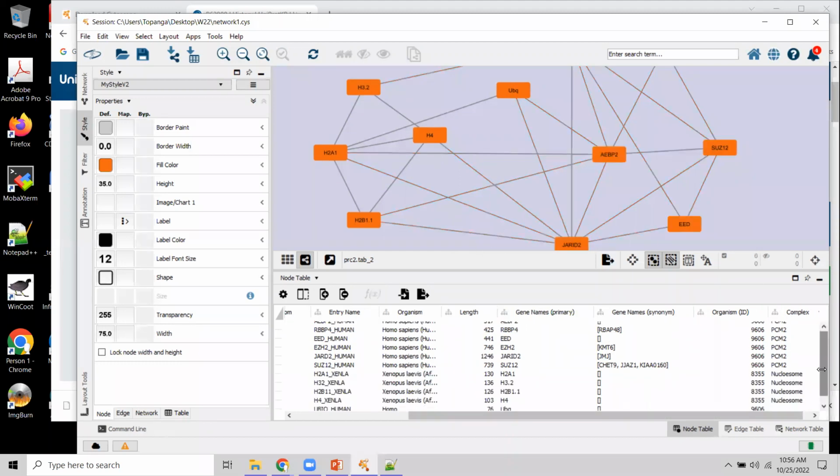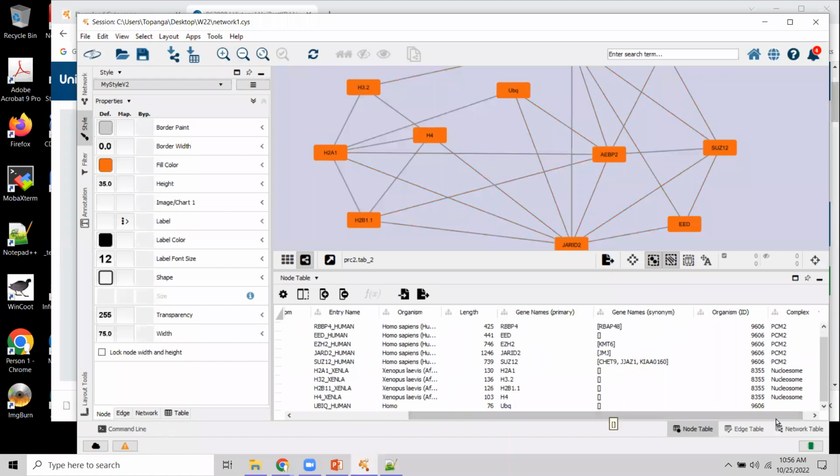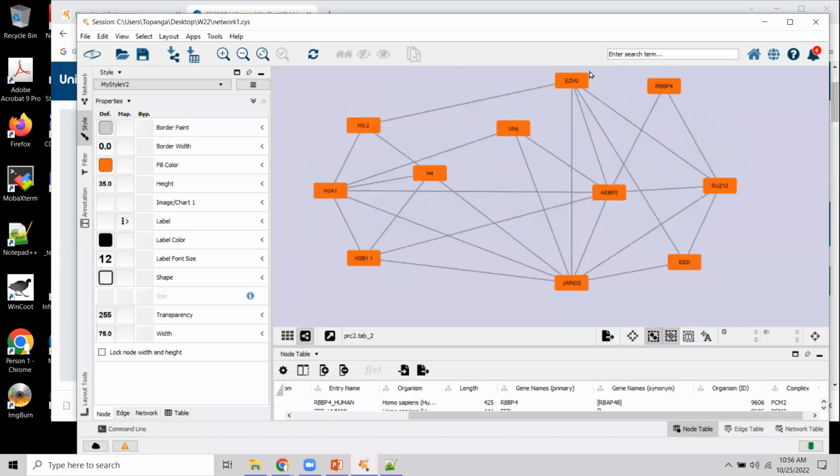Okay, and then there's our ubiquitin without any value here. Having columns like this with the same values for some classes of nodes, let's say for the PCM complex, the polycomb complex with one sticker and histone with another one, if you've got 10 different subsections of a network, is very convenient because it offers you another way of selecting things.